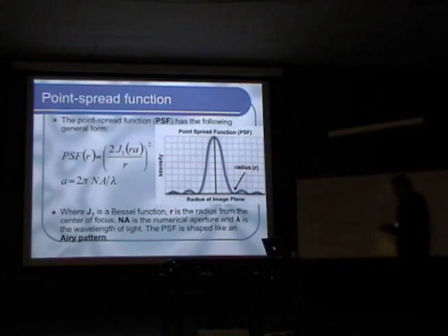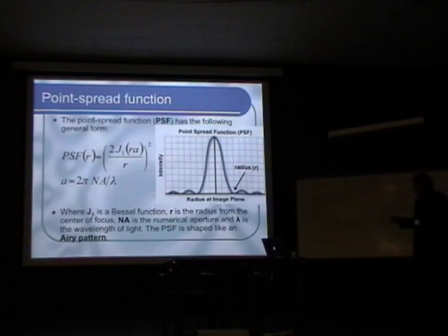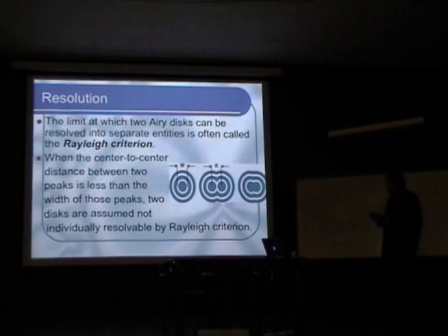It has this Airy pattern. Mathematically it can be defined using this expression that you can see in here, where J1 is a Bessel function and R is the distance from the center of the focus.